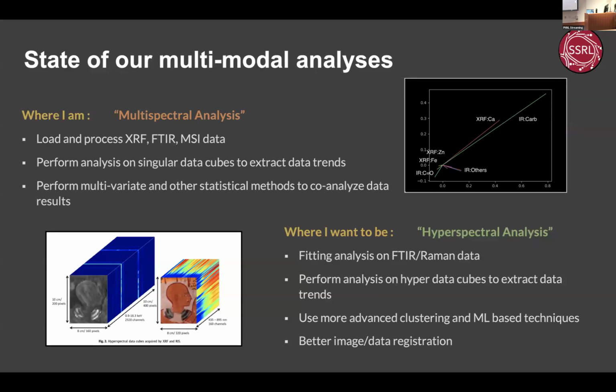So I'll give you the state of where I am on this. In reality, we're in the multispectral world right now. That's what I would consider multispectral. I can load and process all these data sets. We can do some analysis on all of these data sets, and then we can do combined, aligned, registered analysis on the results.